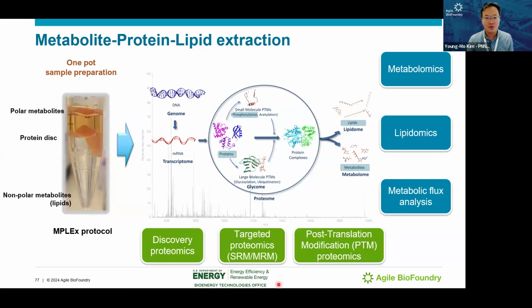At the same time, we also measure certain proteins and peptides in the system because we do a lot of gene modification and editing. Our collaborators are interested in how they are actually expressed or knocked out, so we can measure them by specific targeted proteomics analysis. Not general, but specific. We can also do post-translational modification proteomics. In general, phosphorylation, acetylation, ubiquitination, and many other things can happen on proteins, so we can also screen that PTM information from the protein side.